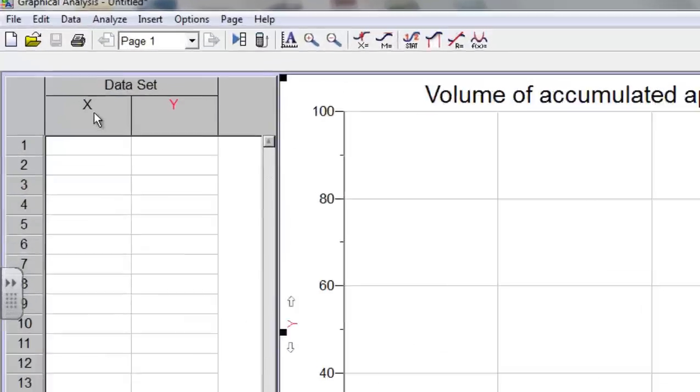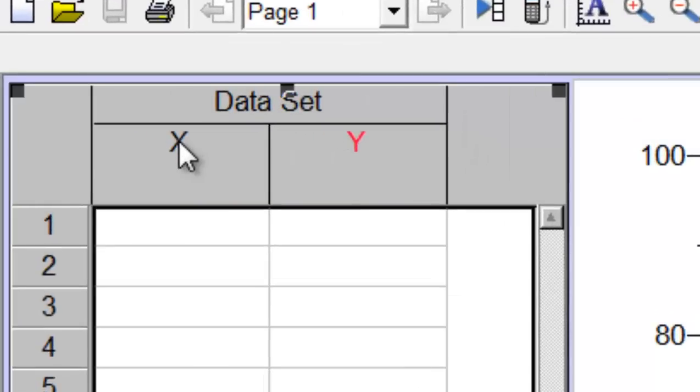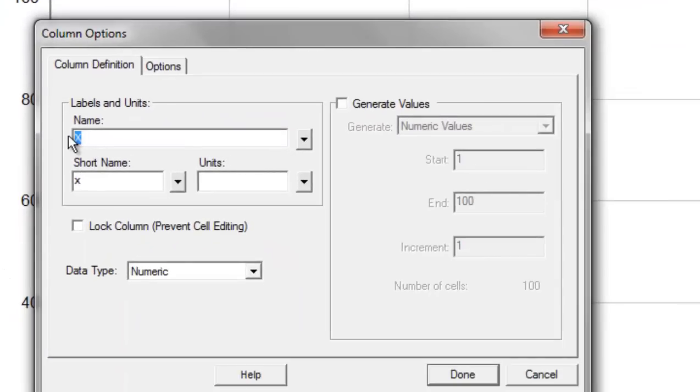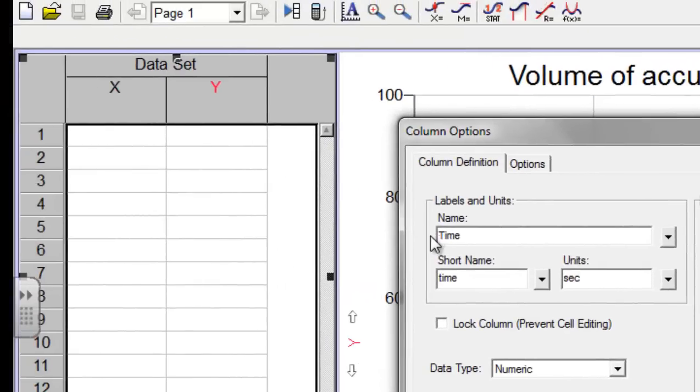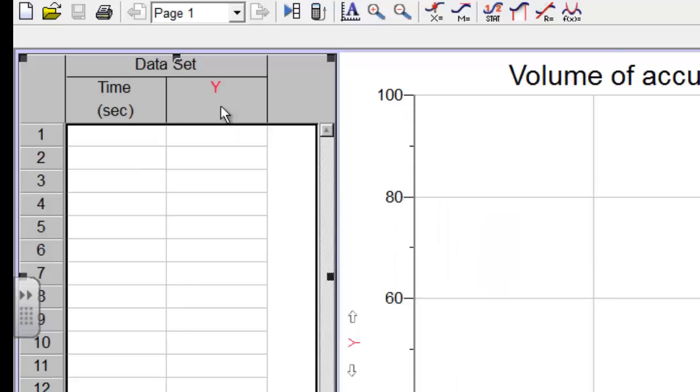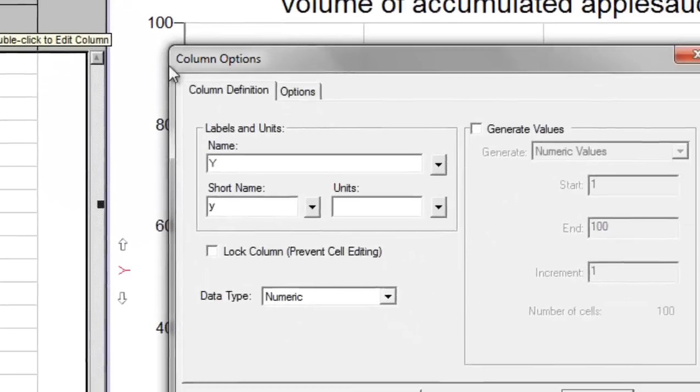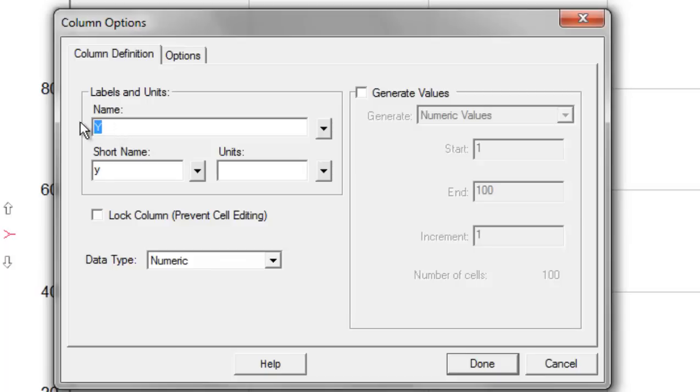A general good descriptive title is y-axis related to x-axis. What I'm going to do is label those axes and I'm going to do it up here by double clicking on the x. Here what should my x-axis be? It should be time. I'm going to do a short name and what are my units? Looks like this group used seconds, so I'll just put SEC which is an abbreviation for seconds.